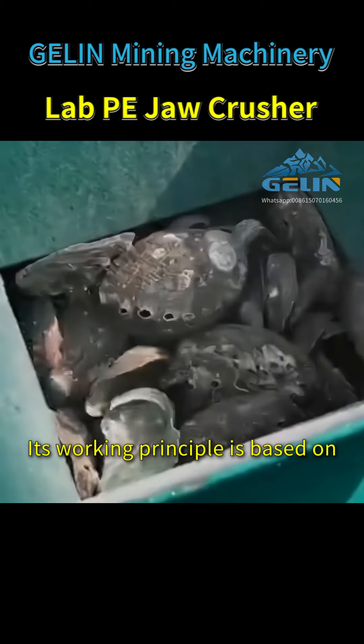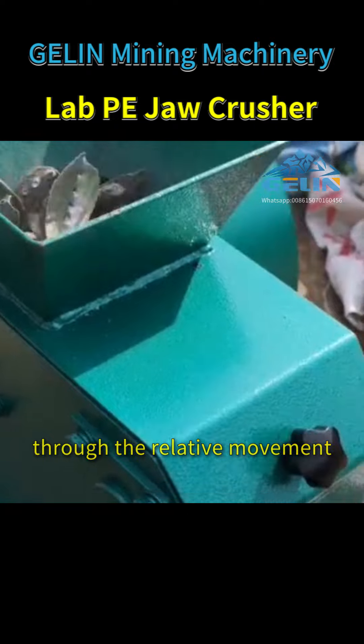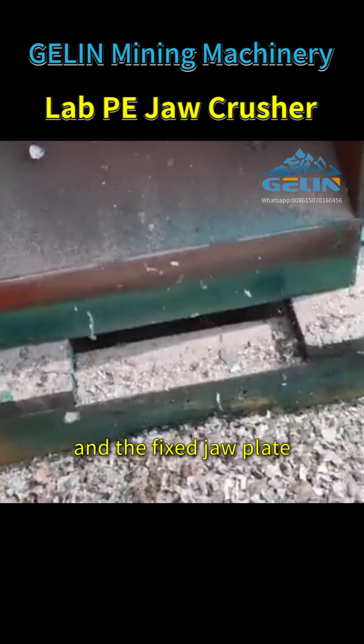Its working principle is based on the bending and extrusion mode, achieving the crushing of materials through the relative movement between the movable jaw and the fixed jaw plate.